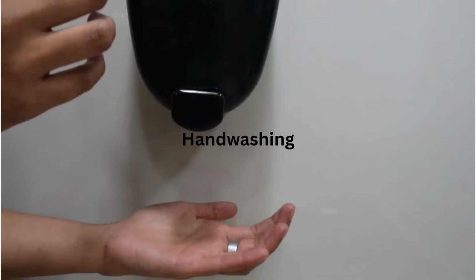The video that I will be showing you right now, class, is the steps on proper hand washing. Since we will be having a proficiency examination regarding this, I will be uploading a checklist of the steps on how to properly wash your hands. So this means you have to familiarize, if not memorize, the different steps for you to master proper hand washing.